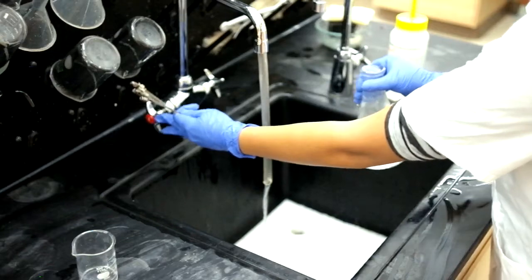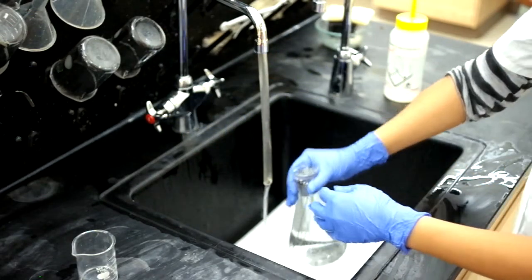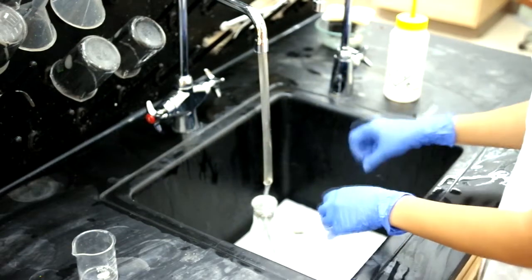Select the clogged needles, place them into an Erlenmeyer flask and run hot water for several minutes to soften the solid residues inside the needles.